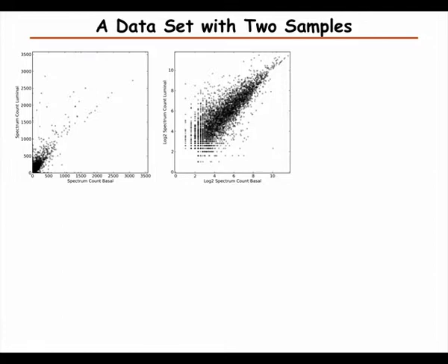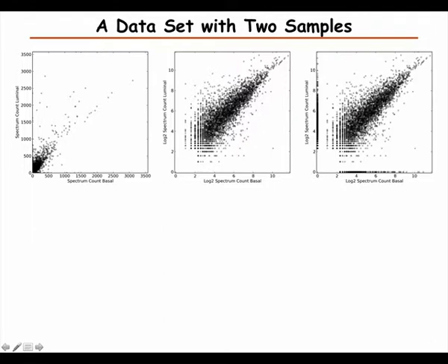Here we can see much better what's happening: a lot of the proteins are very similar. This is spectral counting data, so that's why at low counts you see discrete points, because it's integers that we're counting. The other thing is that since we moved to a log-log scale, we lost the ones that were 0 in one of the samples. So in this case, we've added them back at an arbitrary position just to show them. We should try to put them very close to the axis at 0.